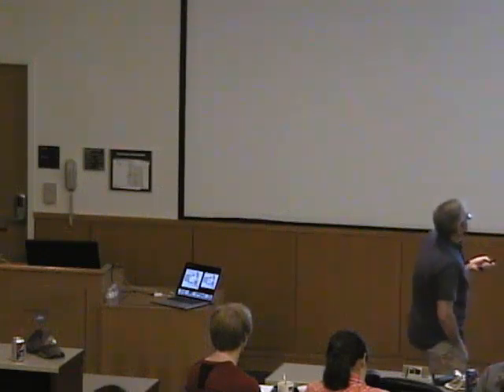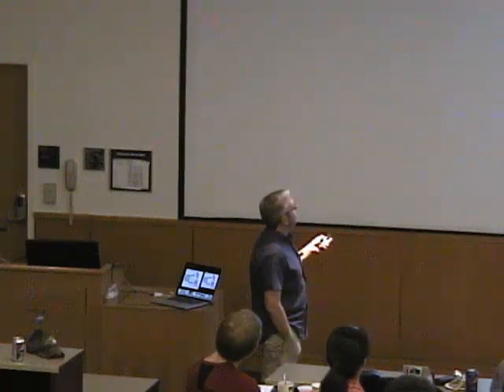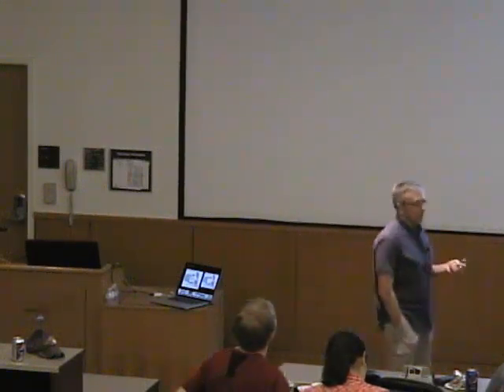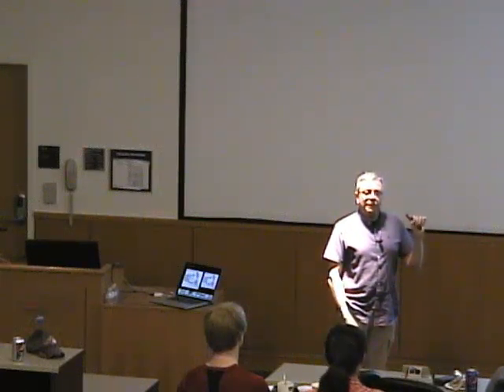So we want to get to a three-dimensional structural model, and in order to do that, we have to build that model manually or in an automated way into an electron density map. But that's an interpretation. Every model that you're looking at is an interpretation of an electron density map, and the model per se has 3 decimals for each atomic coordinate, which is given in angstroms.